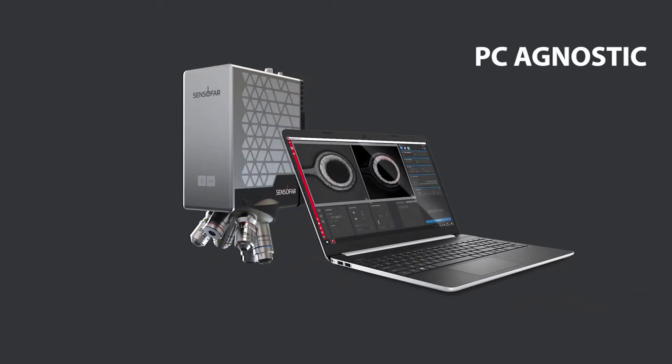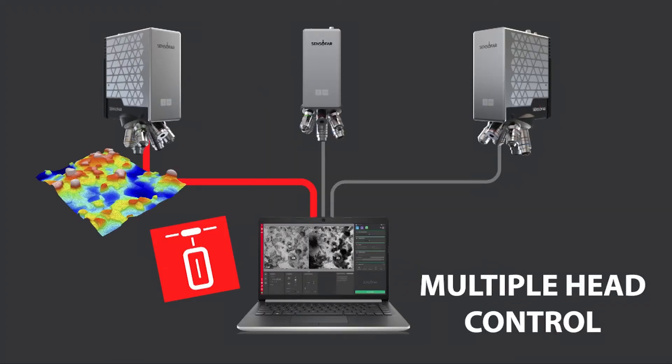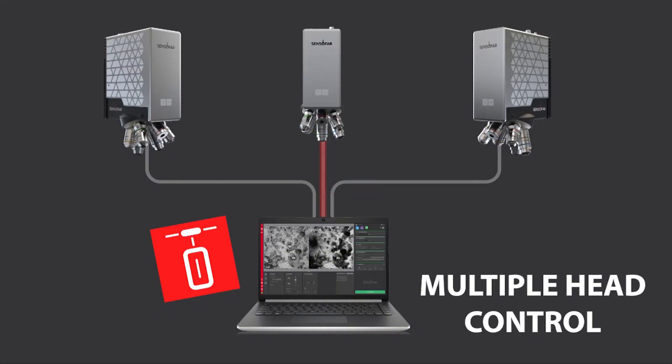The S-Smart 2 can be controlled from different client computers, and through an SDK it is possible to run several heads simultaneously.